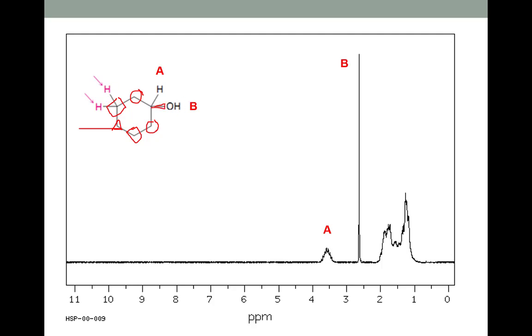If we add some stereochemistry here, one of these hydrogens is above the ring with the oxygen, and the other one is a little further away below the ring. Same is true all the way around the ring. We do technically have a slightly different signal for these two, and a slightly different signal for all of these. But all of that ring hydrogen stuff is showing up in what I like to affectionately call a blob.